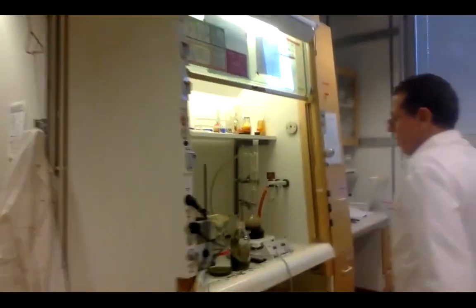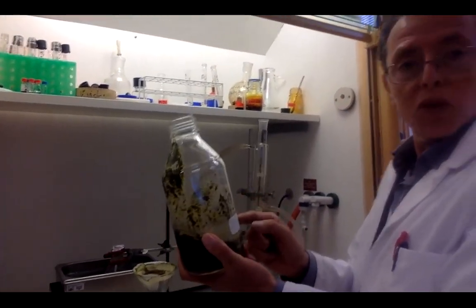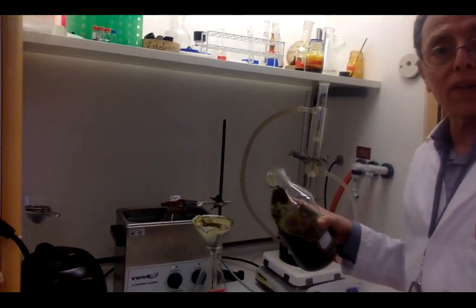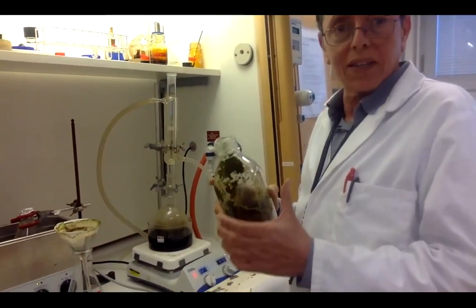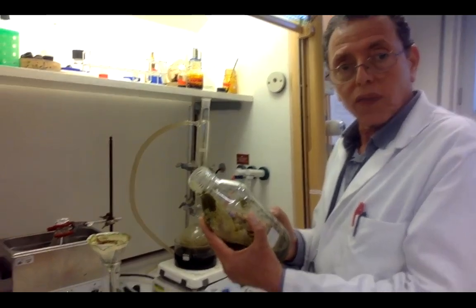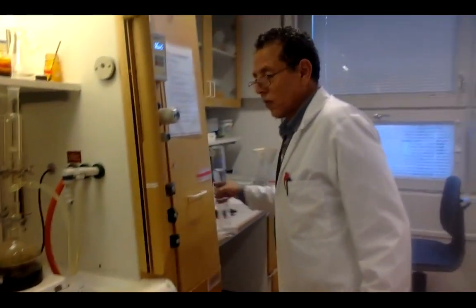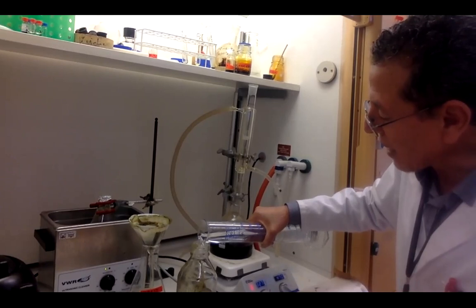Now we start the extraction. There are several methods. The first is maceration: you take the solvent, put the solvent in, and leave it overnight, then filter it. If you are working with a plant for the first time and you want to get everything from it, the safe approach is to use an organic solvent first, like DCM or DCM/methanol, leave it overnight, then filter it.